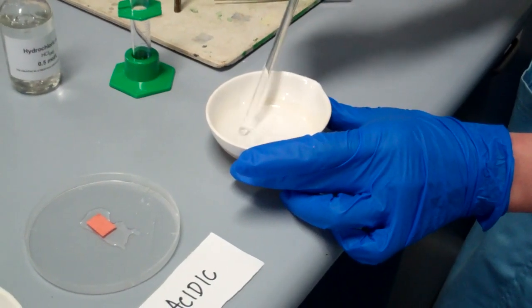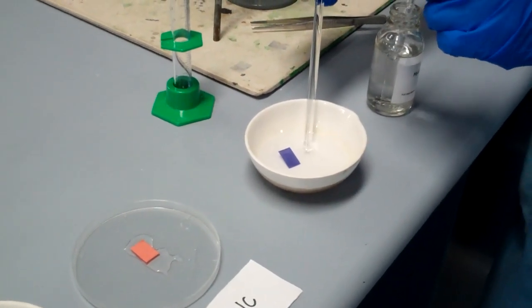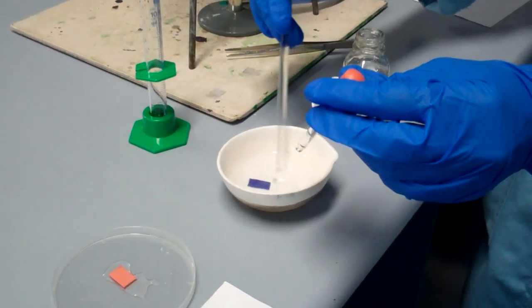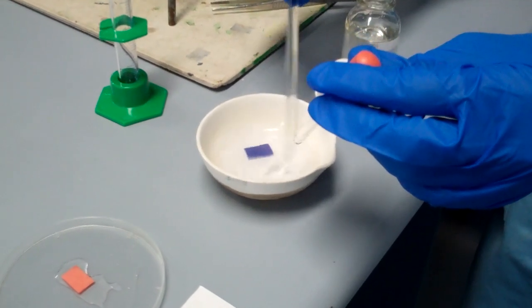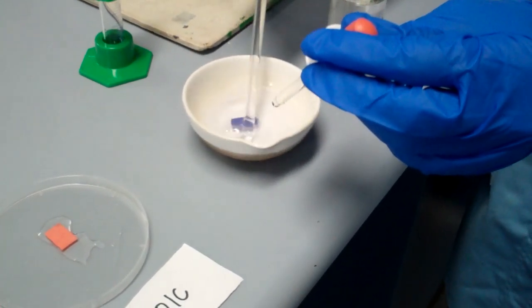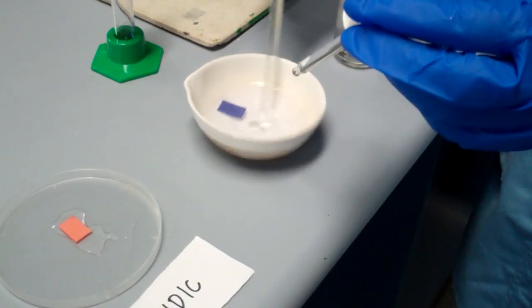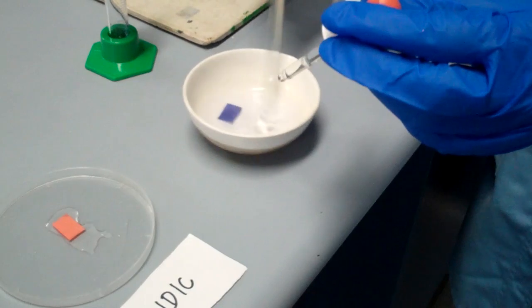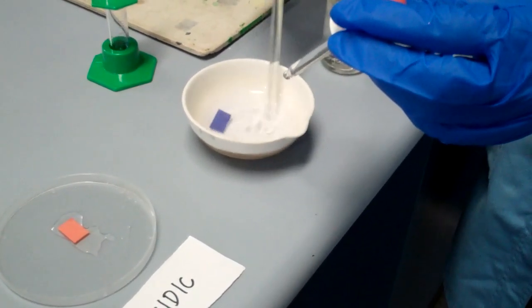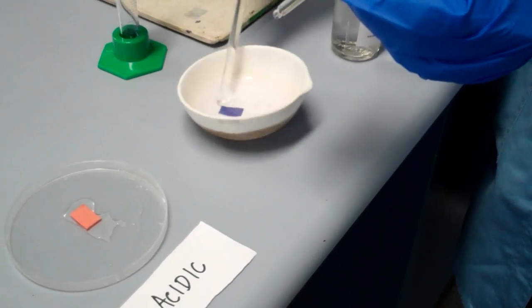The next step is to add your hydrochloric acid dropwise into your solution mixture, and continue to stir it until you see a permanent color change on your litmus paper. I will do it bit by bit. If you look at the litmus paper, the color is still the same as before. If, let's say, you add too much hydrochloric acid, then you will probably just need to neutralize it with a little bit of the base to bring the pH up a little bit more. But at the moment, I think we are fine. So we just need to be careful of adding it dropwise.